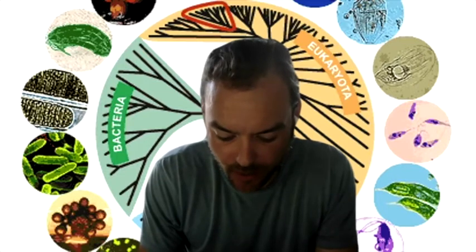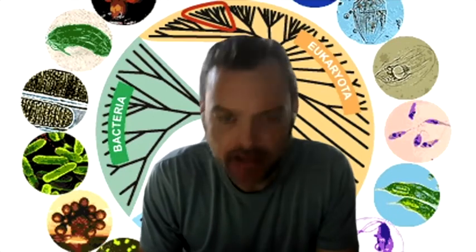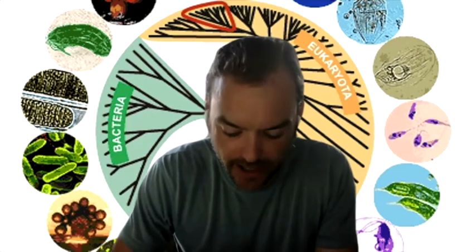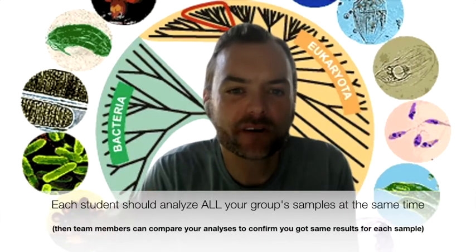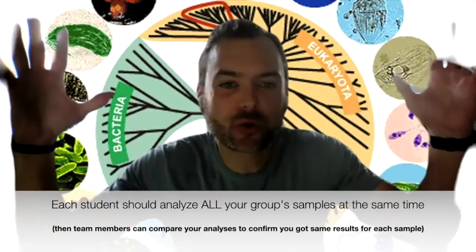The other thing I want to remind everybody is that in these examples, I'm only going to analyze one sample, but I want to encourage you guys to remember that you're going to be analyzing all of your group samples. So, with no further ado, DNA Subway.